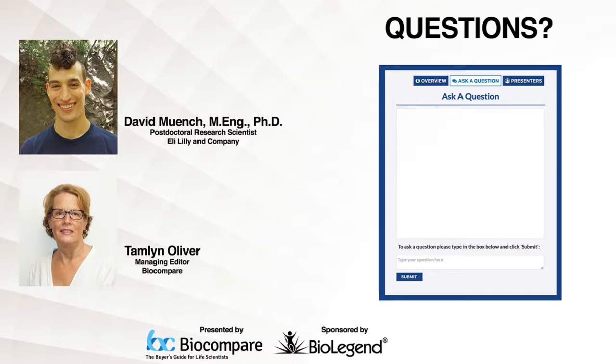I believe, if I remember, one group used a technique similar to CITE-Seq and published a data set with, I think it was around 100 markers. And I think there might be some technical considerations surrounding library prep and sequencing as the number of total-seq antibodies you use increases. But moving forward, I'm excited to see how other groups are able to use many, many markers in their analyses.